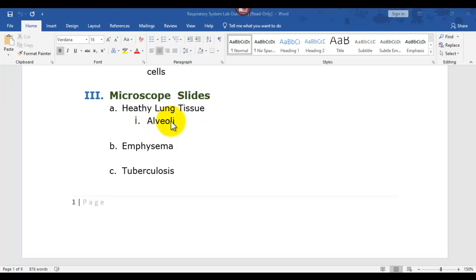What we have is a slide of healthy lung tissue, and I'll show you some alveoli, little air sacs in there. One of emphysema, which is a disease state with damage to the alveoli. The walls have collapsed and you have these big areas that are called physiological dead space where there's no gas exchange.